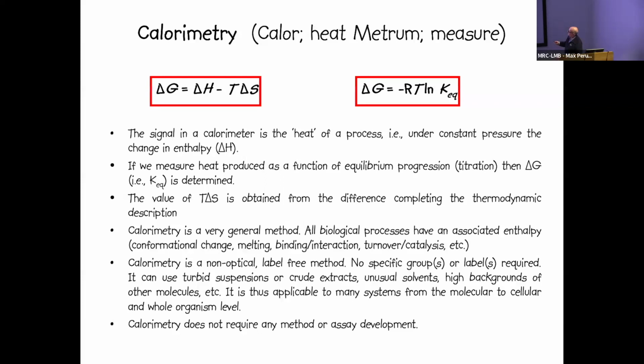Once we've measured the enthalpy and the free energy, we can obviously then obtain the entropy. And this gives us a complete thermodynamic description of the equilibrium process we're studying. So this in itself seems like a pretty good reason to think about doing calorimetry, particularly on biological systems.